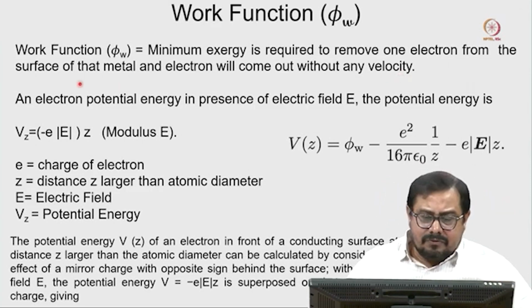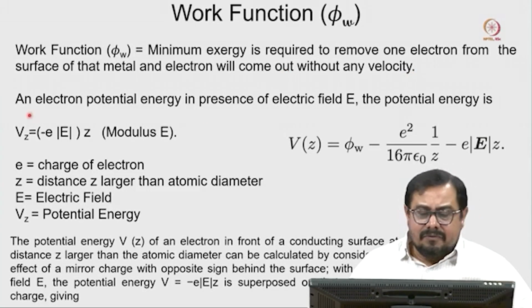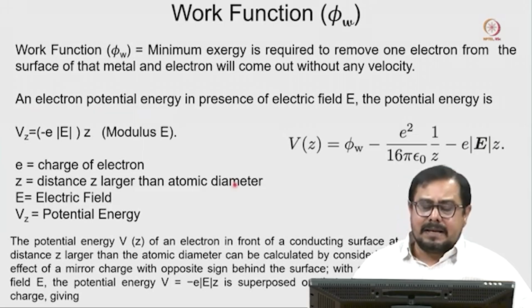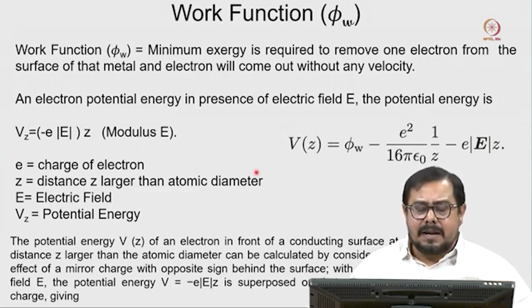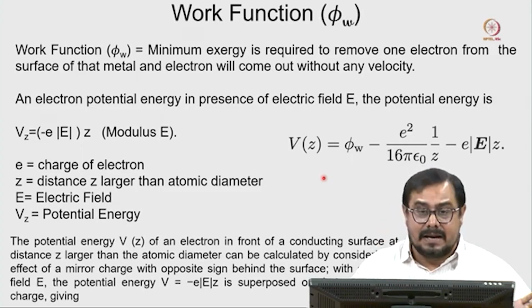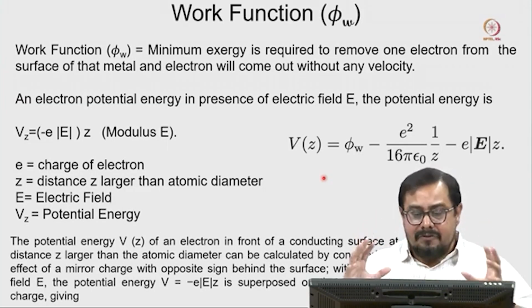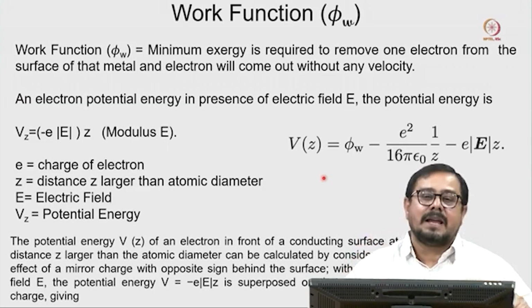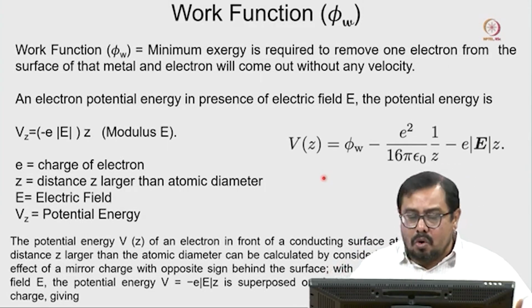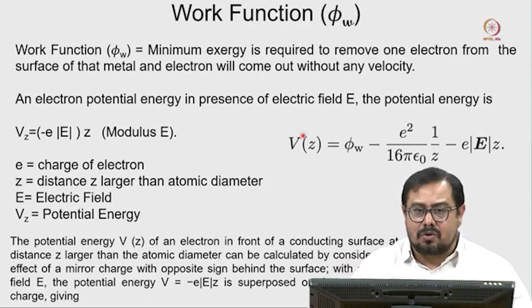So, that is very important here. Now, there is a very basic formula we are writing here. It is not mandatory that you have to remember all this formula or mathematical derivation or physics behind this formula, because this is the microscope course mainly focusing on the biological application. But it is good to know what this work function is, how we are making an electron gun.